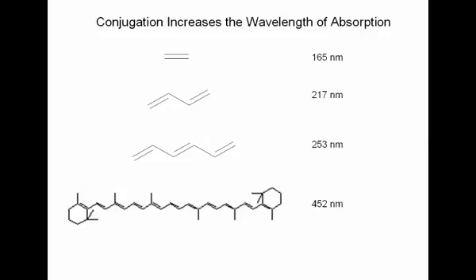When you take your TLC plate and you put it underneath the ultraviolet light, that ultraviolet light is emitting a 254 nanometer ultraviolet light that then strikes the plate, and there's a molecule there that fluoresces and turns the plate green. That's the type of wavelength that we're looking at. Black light wouldn't do that.